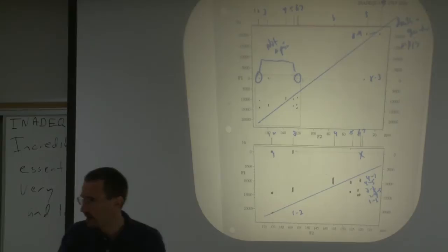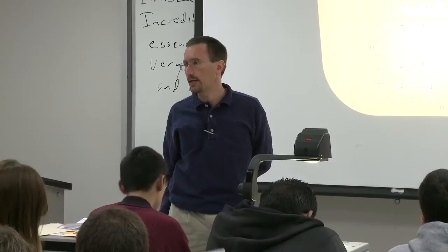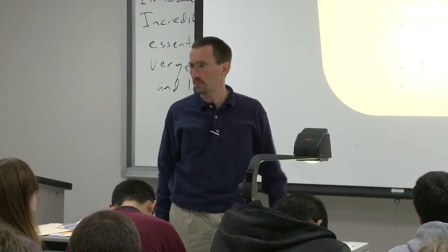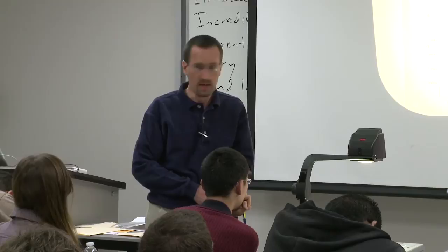Do you ever see any type of long range coupling like this? Or is that not an issue? I think the answer is it could be an issue. Your Pretsch book and Silverstein will give you your J2 and J3 CC coupling, and they're going to be a lot smaller. We already saw on that Santonin problem, that very nice sesquiterpene problem, that darn peak from 4-7E, which, by the way, I have now put a note on the problem.